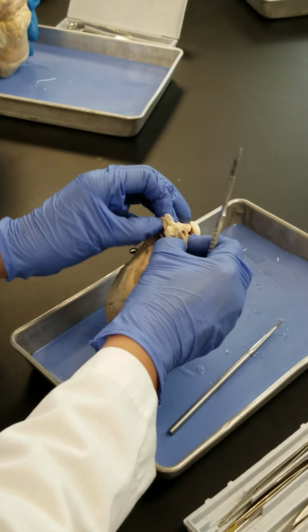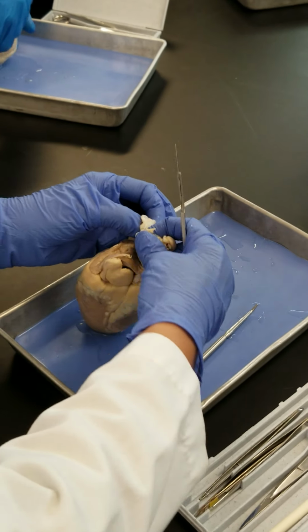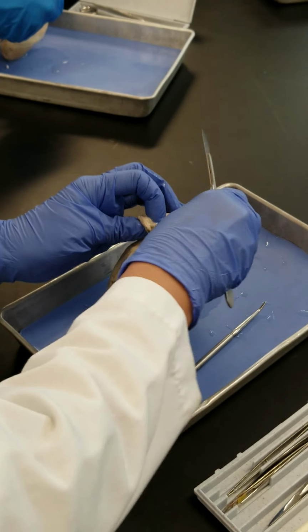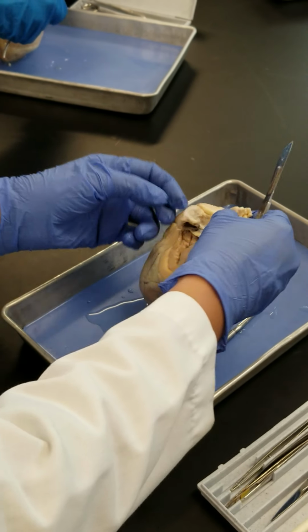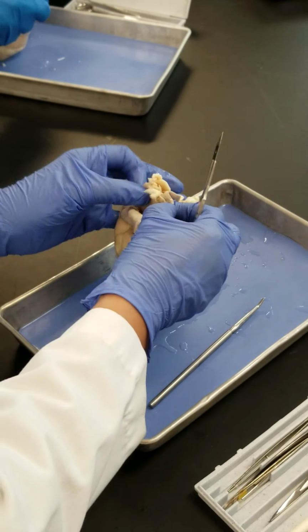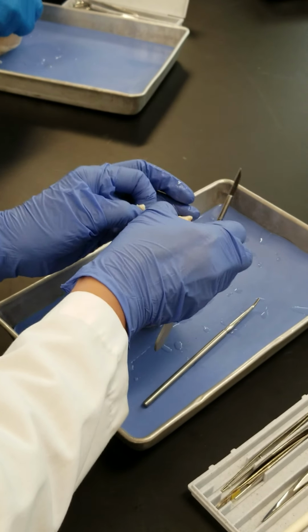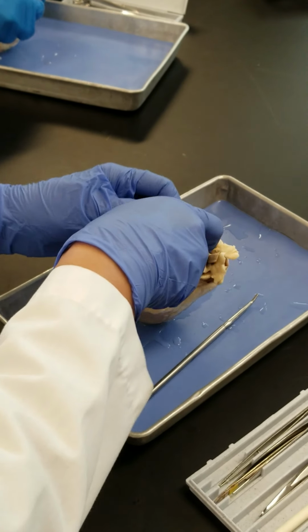So you can use this one to just separate these vessels from each other so that we can see them better. So we just separate some fat. So much fat. As you see, we do not need much of the knife or scalpel.